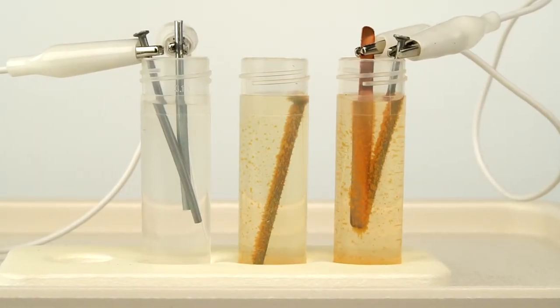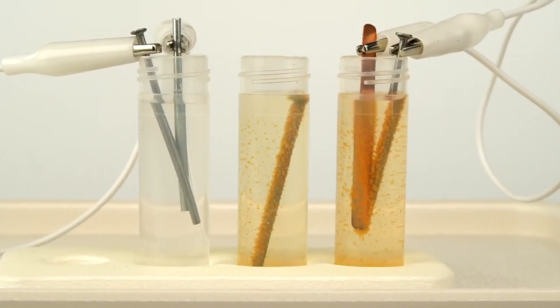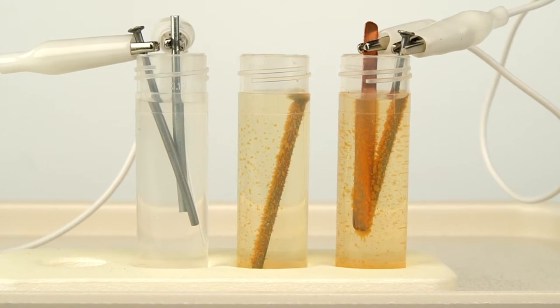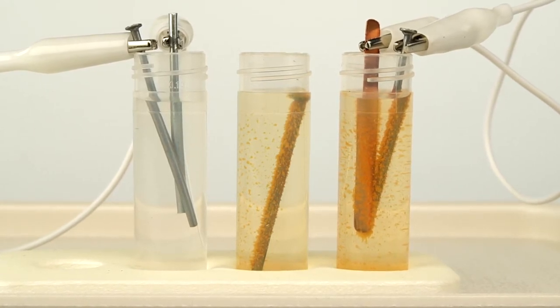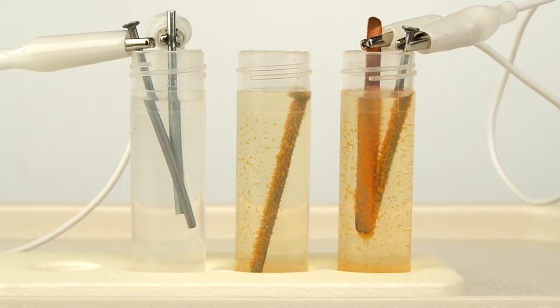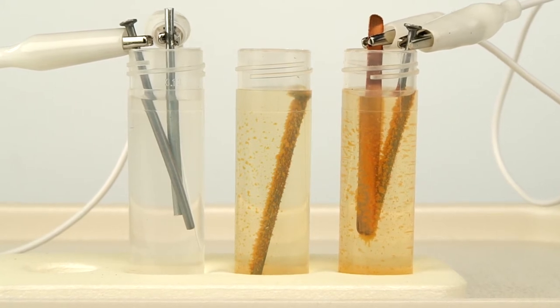Compare your vials after 24 hours. Electrons travel along the wires from the more reactive to the less reactive metal. The fewer electrons a metal is left with, the faster it corrodes.